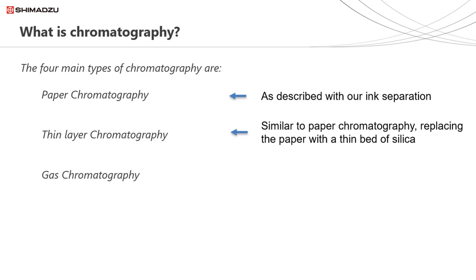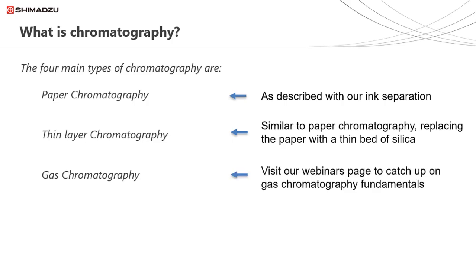Gas chromatography. Please visit the Shimadzu UK website for links on webinars on the fundamentals of gas chromatography should you wish to know more about the fundamentals and basics of gas chromatography. Finally, liquid chromatography, which is the topic of today's and future sessions.